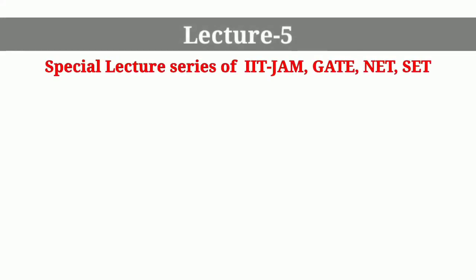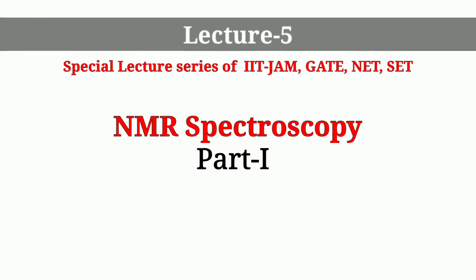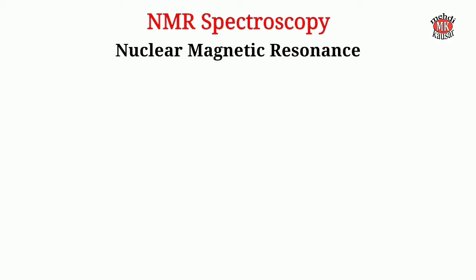Hello my dear students, in this lecture series for IIT JAM, GATE, NET and SET etc. exams, in this video we are going to discuss the basic principles of NMR spectroscopy. NMR stands for Nuclear Magnetic Resonance.